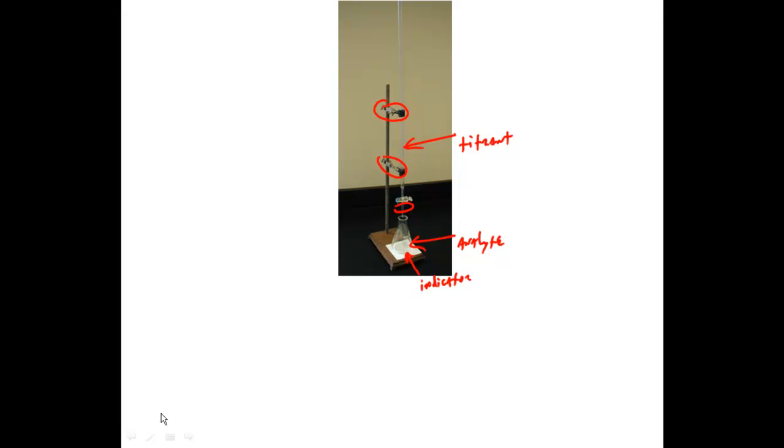Then you start opening up your stopcock and let the solution go. Sometimes, so that you can see the color change a little easier, we put a white piece of paper under the flask. Our goal here is to add our titrant until we get a color change in the solution. In this particular experiment, we're looking for a pink color. You'd like it to be a very faint pink color, where you get that one drop difference, and it persists for like 30 to 60 seconds.